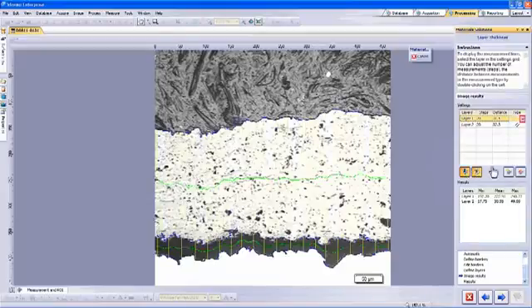To select a different measurement type, click on the down arrow button. There are 3 types of measurements we can use for the layer: parallel, perpendicular, and shortest distance. The parallel is our default one and aligns the measurements parallel to each other along the layer. Perpendicular will align them perpendicular with the neutral fiber line in green, and shortest distance will only show the measurement lines with the shortest distance in the layer.